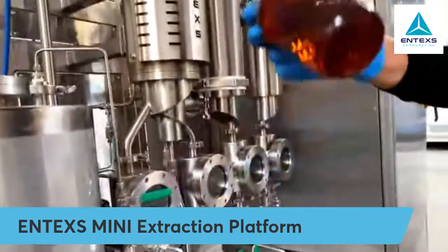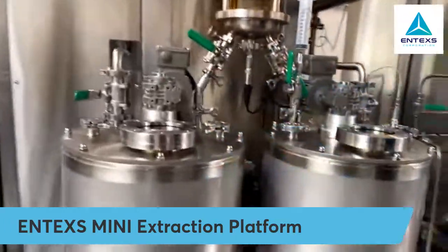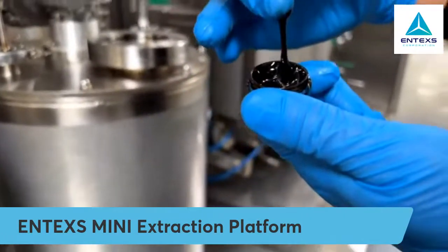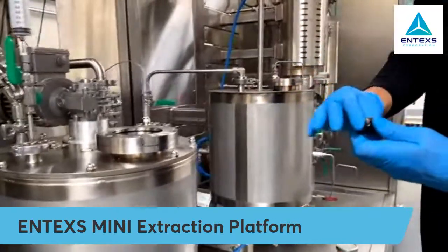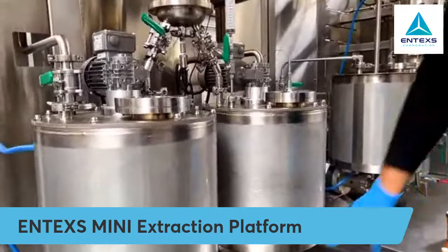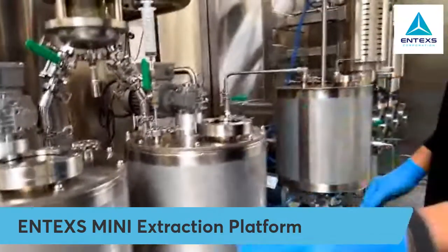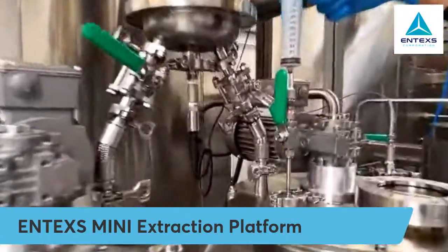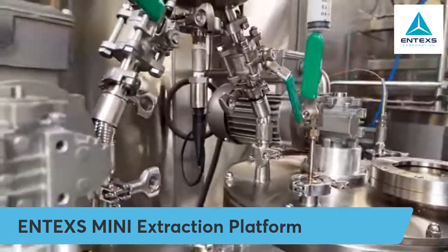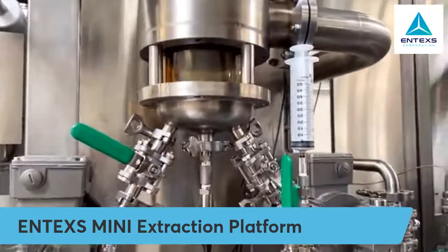That's your process for running distillate — this is T-free distillate, which I'll get into in a minute. Speaking of product transfer from this part of the equipment on: when you make crude, it's very viscous and very thick. When it's cool, you can't pump it. So from this part of the process on, we've taken specific design features to transfer the product to make it pumpable — everything's jacketed, and all the lines have thermal loops running through them to keep the product hot so when you turn a pump on, it actually pumps. We also have a sampling port that lets you take a real-time sample — very useful when running HPLC or other analyses.